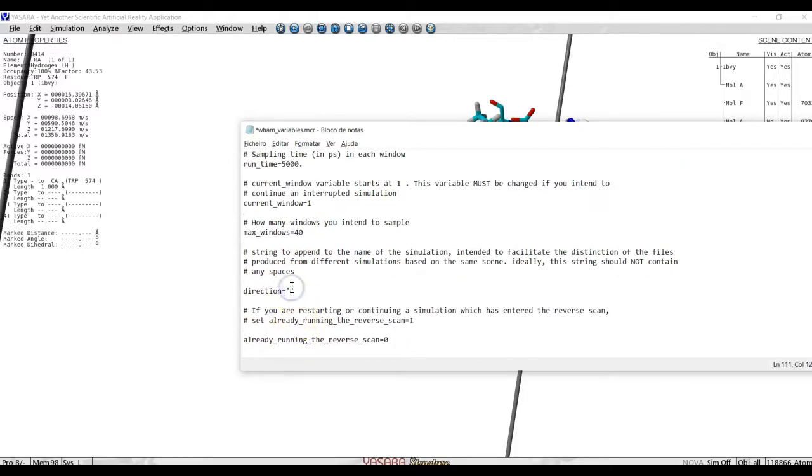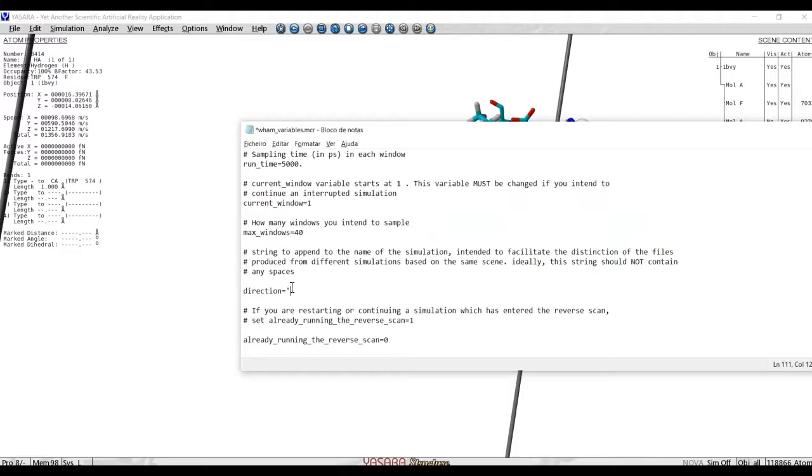Direction, this is just a dummy variable, which is used to change the name of the output files. Because sometimes we want to use the same system, the same scene, the same macro target, and we want to use umbrella sampling in different directions, so that the files will not get mixed up between different runs. We could obviously just run them in different directories, or we can here change this variable direction, and call it, let's say, fast run, or second run, or whatever.